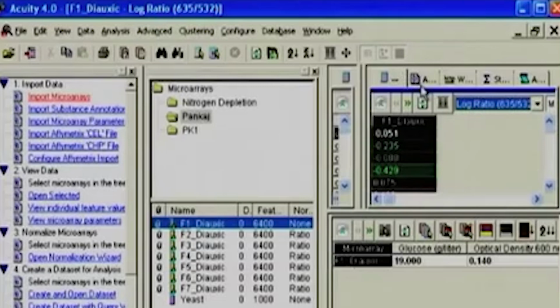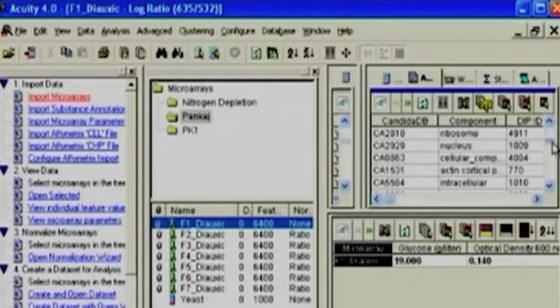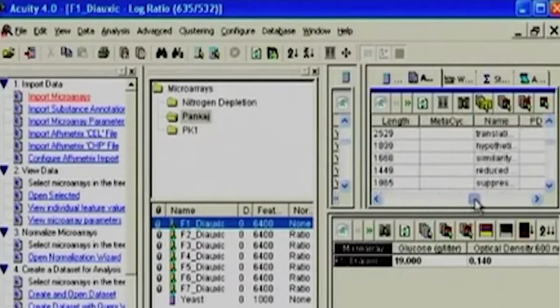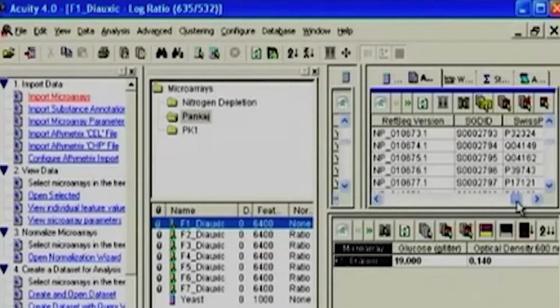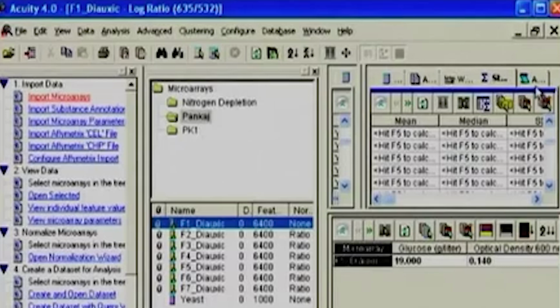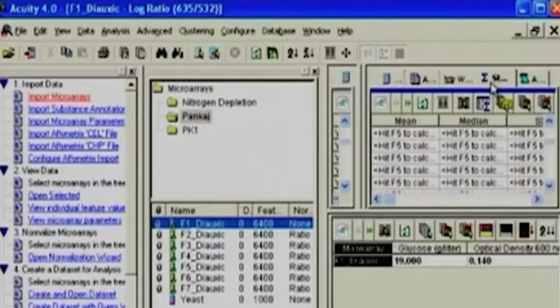Apart from this, the other tab includes the annotation, which gives you what all different ones are tracing at the level of annotation names in the form of different databases, information on the genes or how the protein is behaving or even the localization, where it is being localized, all that can be traced. And the other one also gives a little bit of other details in the form of statistics, warehouses and a few of the auto scripting capability which advanced users sometimes want to use. But this particular statistic will allow you to see what all you want to see, which we see in detail. In the bottom, what you essentially see is how the data is looked at.